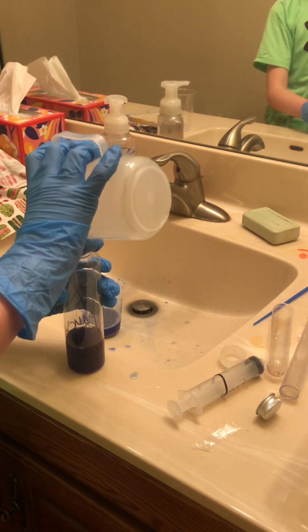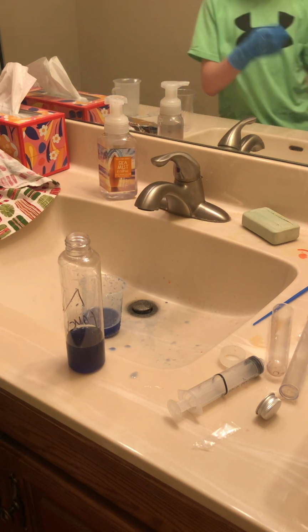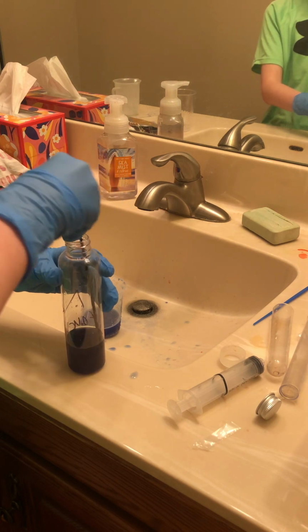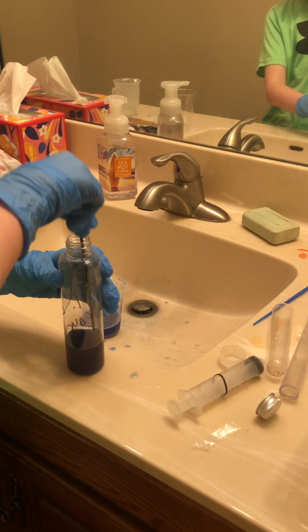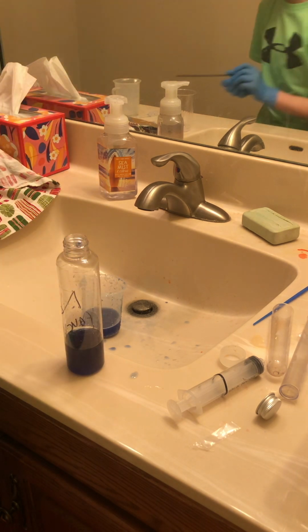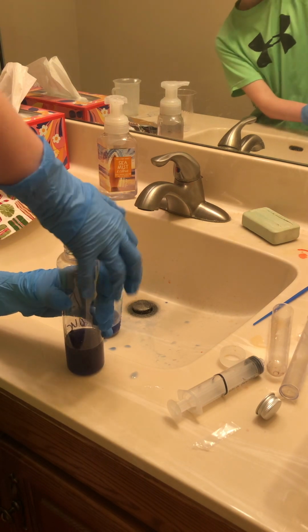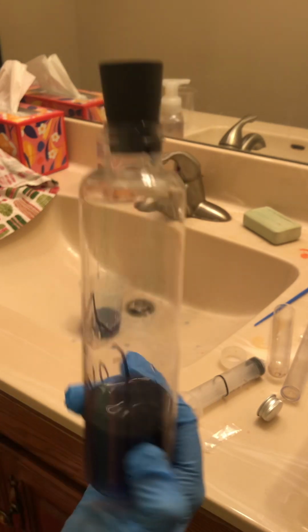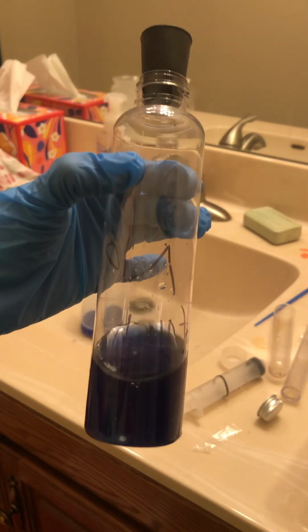So yeah, that's what I like to do. Then here's where the tamper comes in useful. You're just gonna stir it. Make sure all the chunks are crushed. That's the only thing the tamper is used for. You're gonna take the stopper, you're gonna cap it, and now you've got this, which is your byproduct, which you can use as a solution for another experiment.